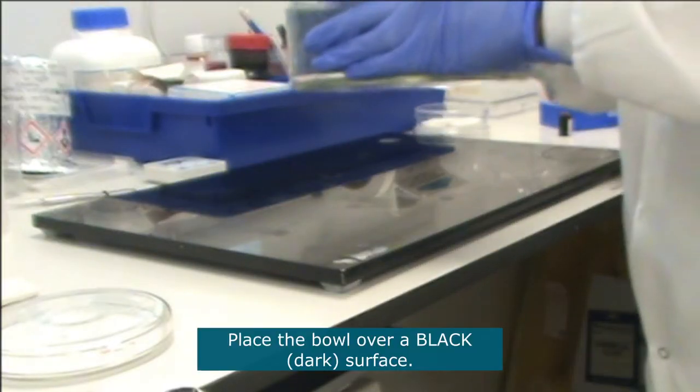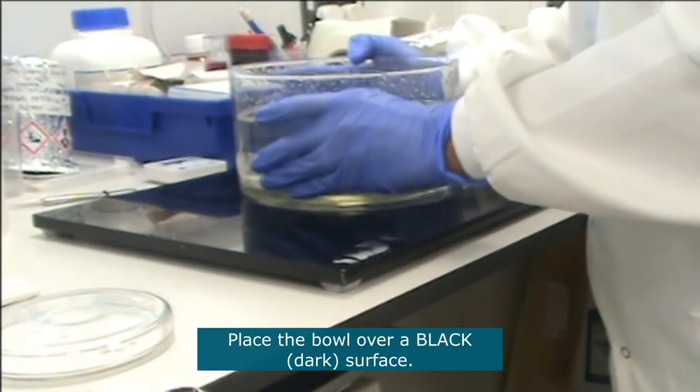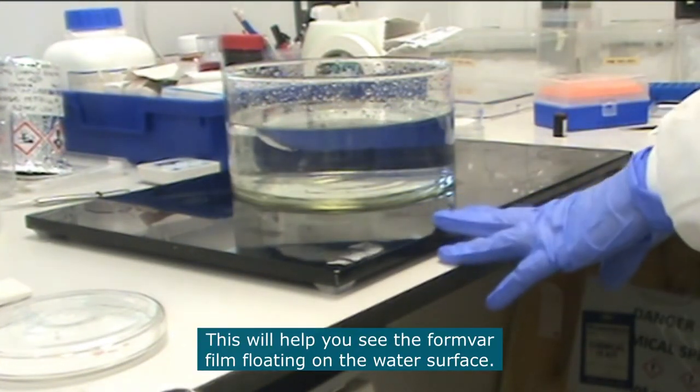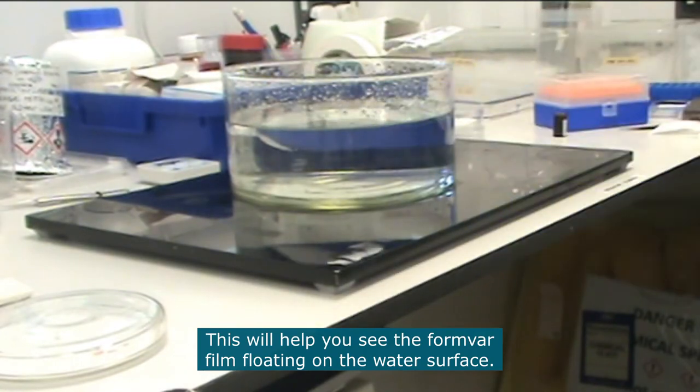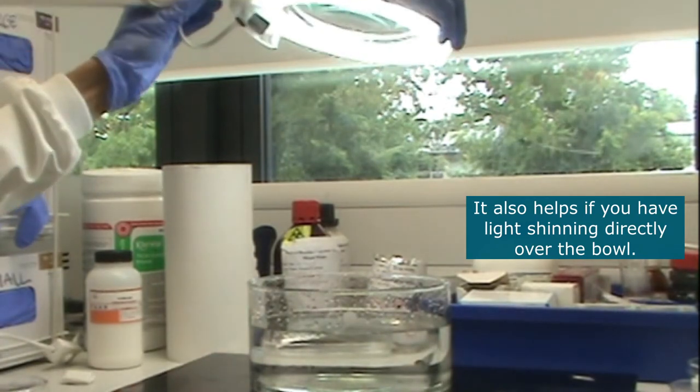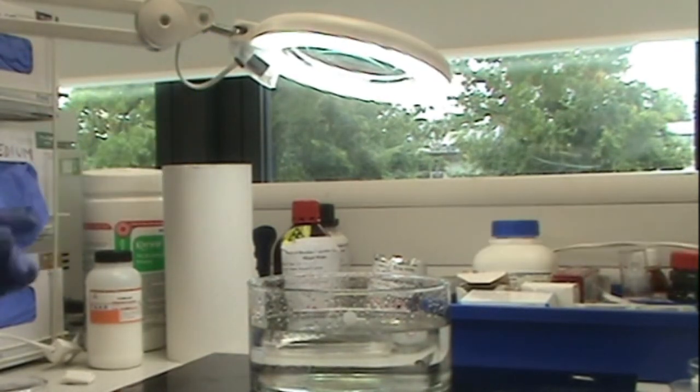Place this glass bowl over a black surface. Placing the bowl over a black surface helps you see the formvar film when it's floating on top of the water. It also helps if you have some light shining directly over the bowl.